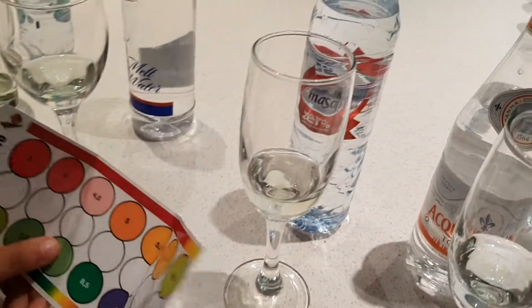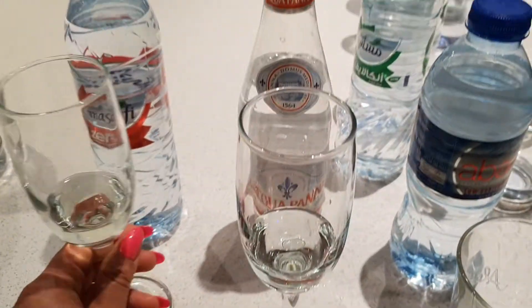Masafi zero sodium — 6.5. Between 6 and 6.5.